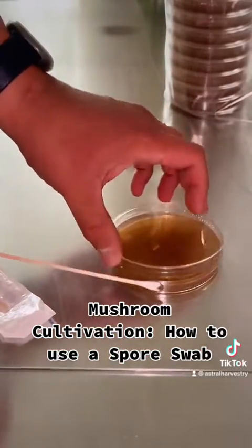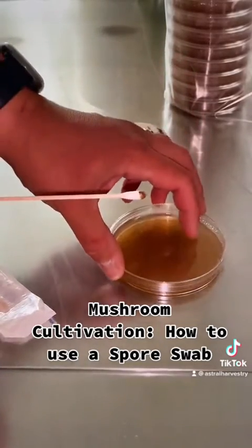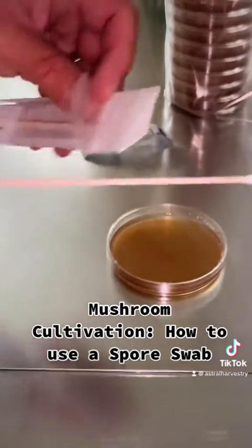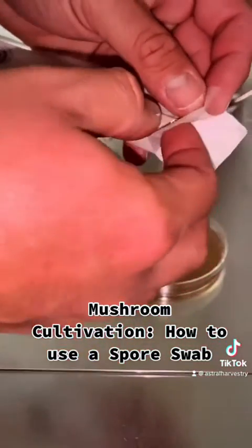Do that in the very center of your guard plate. Lift the swab, place the top back on, and store away your swab for later. You can put it in another container if you'd like.